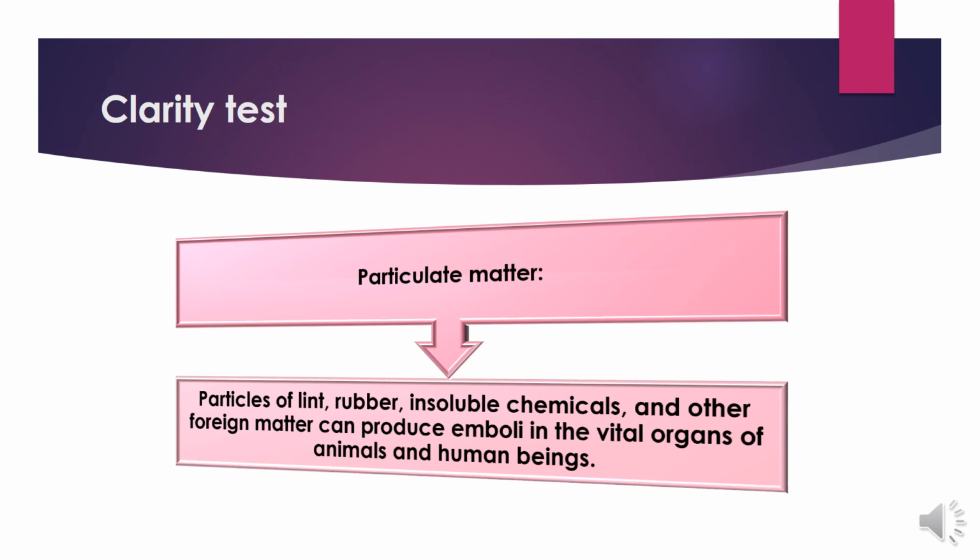These are particles that are shed off through the various equipment or their parts, or the garments and protective gear that are being used by the personnel working in the area. They can shed particles into the preparation.